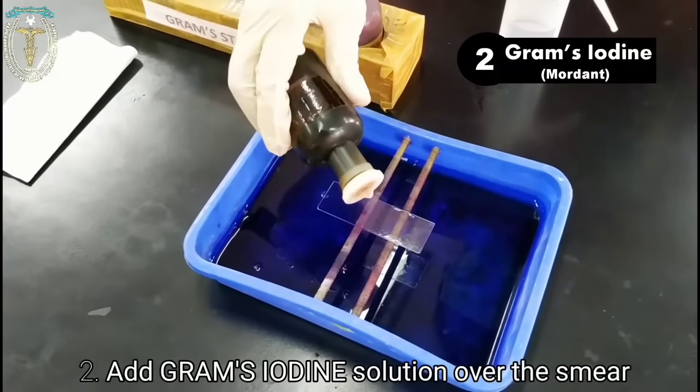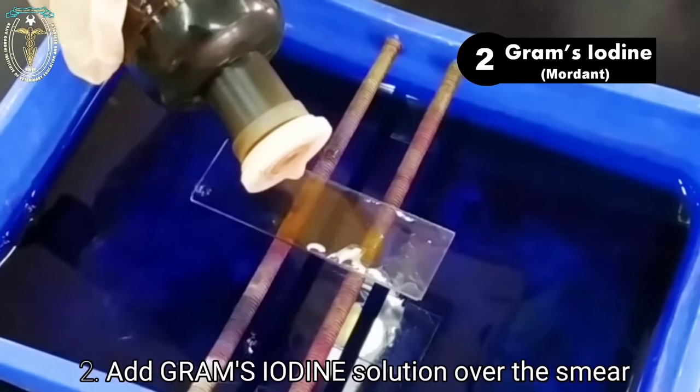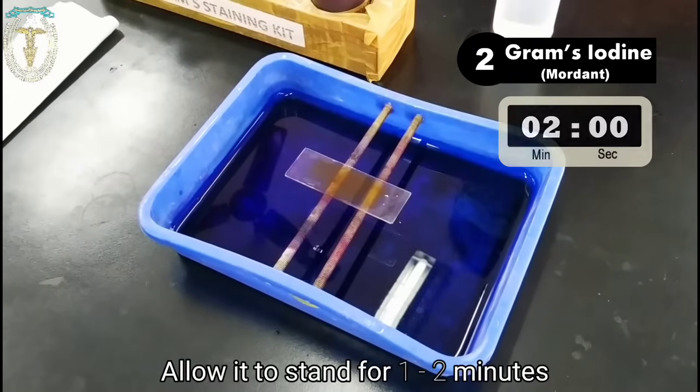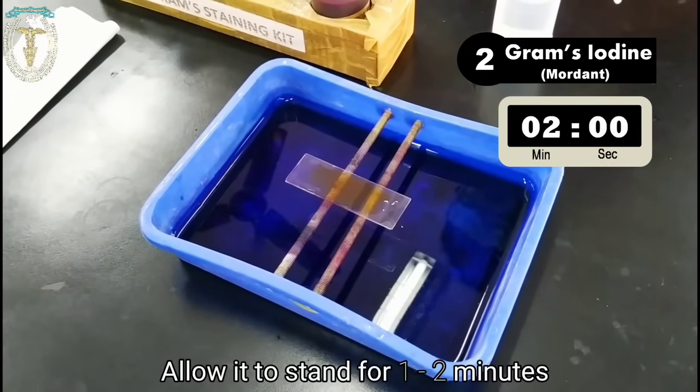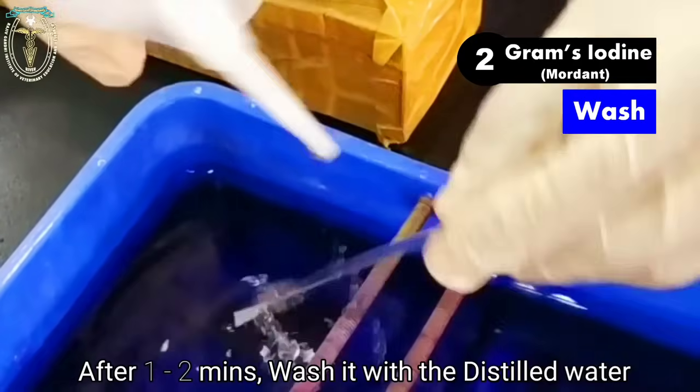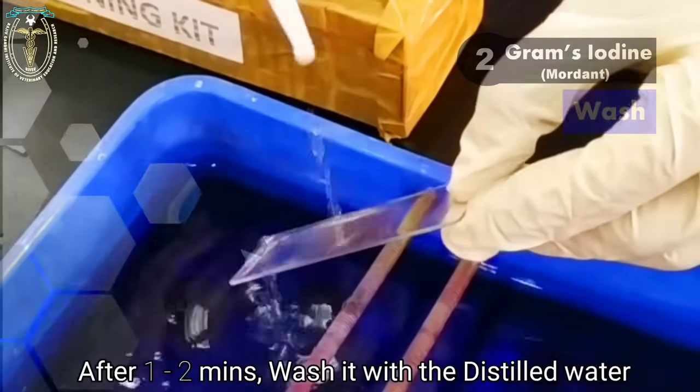Secondly, add the Gram's iodine solution over the smear. Cover the entire smear and allow it to stand for 1 to 2 minutes. After 1 to 2 minutes, wash it with the distilled water.